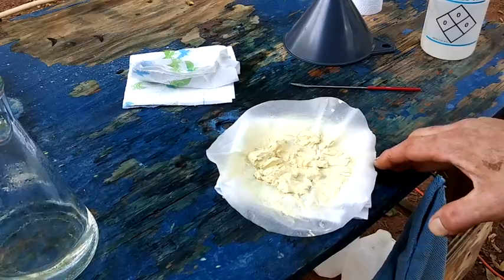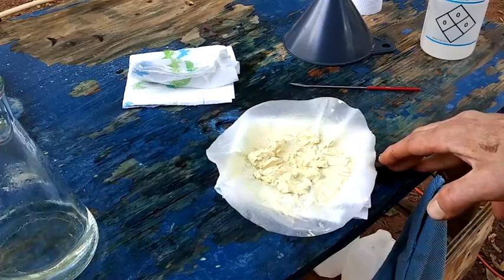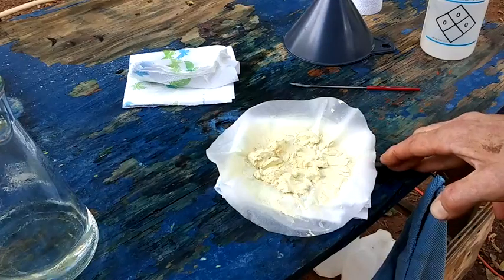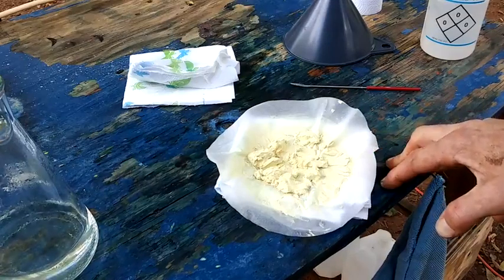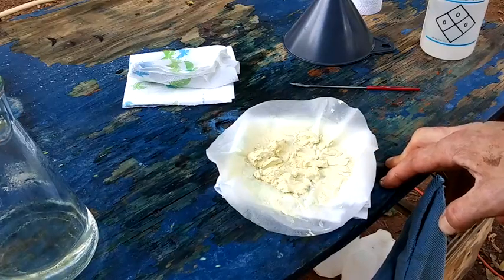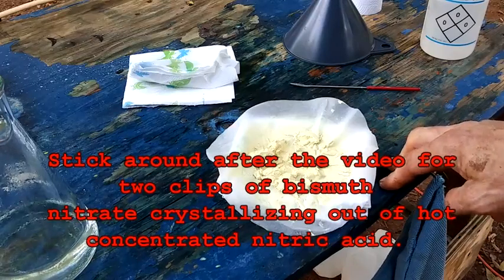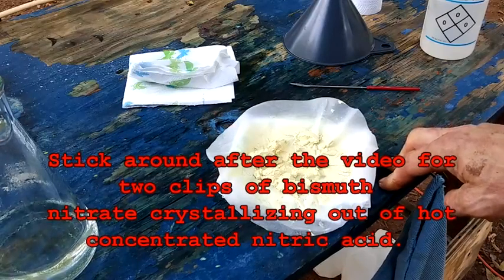So this concludes the first video in our series here, working up towards sodium bismuthate from bismuth metal. Now we've got the bismuth oxide. The next step will be to make the bromine, and then the last step we'll combine everything together and get our bismuthate. So very cool.